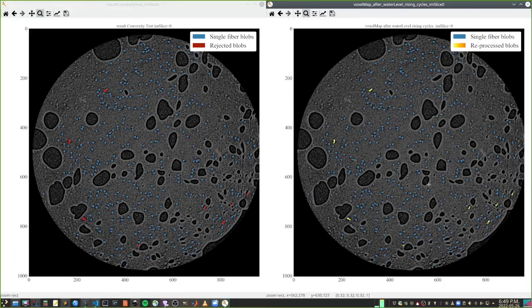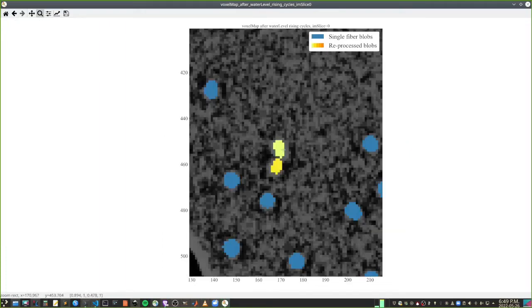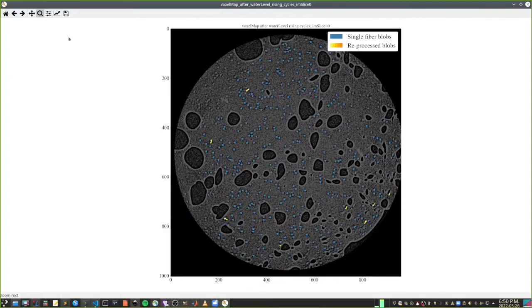Sometimes it doesn't work, like if it's a very small region, or there's not many that are touching. The idea is for each one of these I'm going to assign one centroid, like the center of mass. If the region is not convex, here there are clearly two fibers, but it would have found just one centroid. So I want to find two centroids, that's how we split them, and here it's probably going to work well.